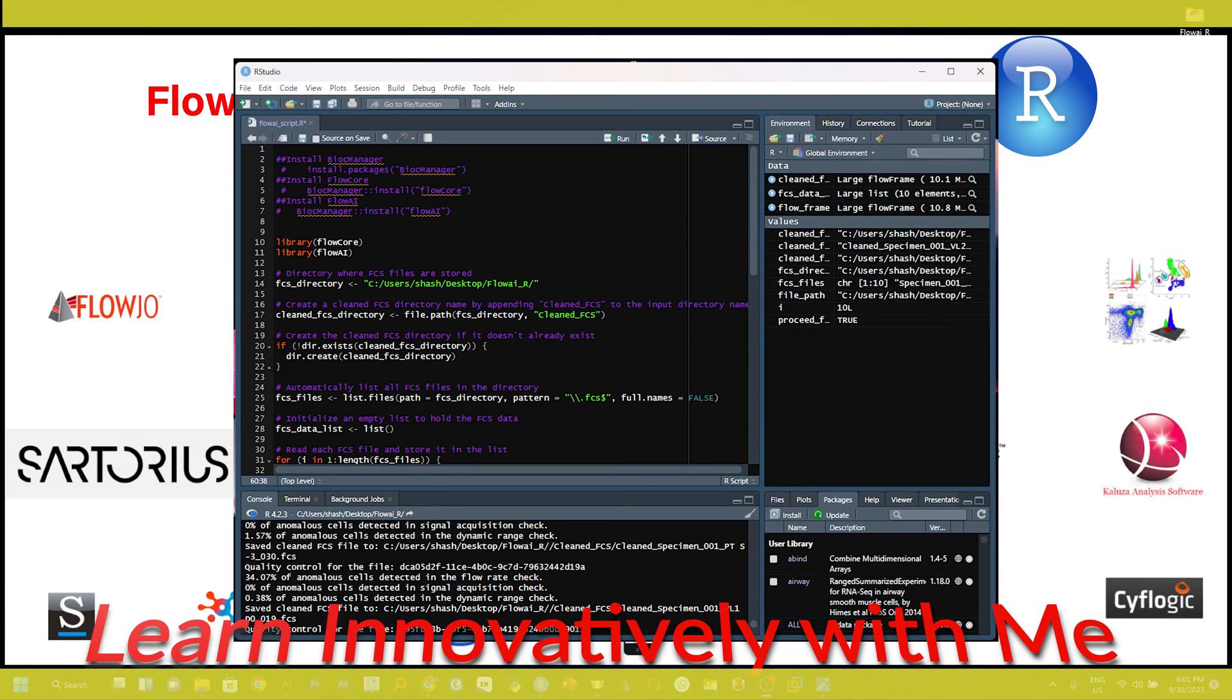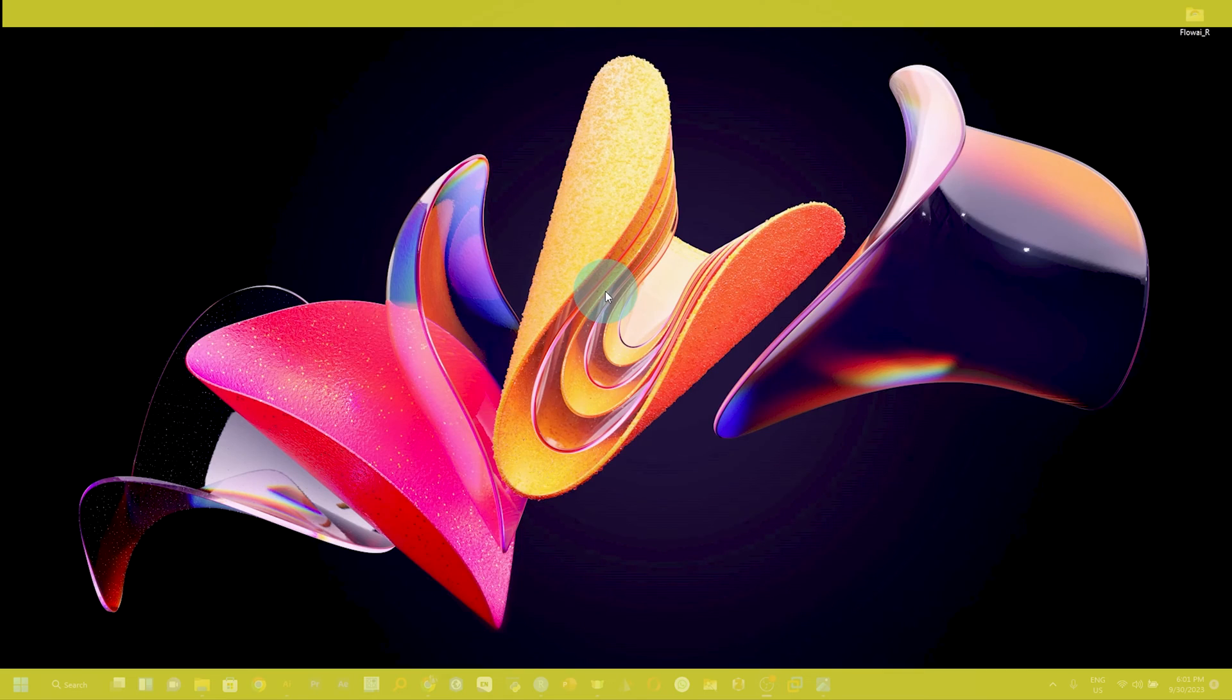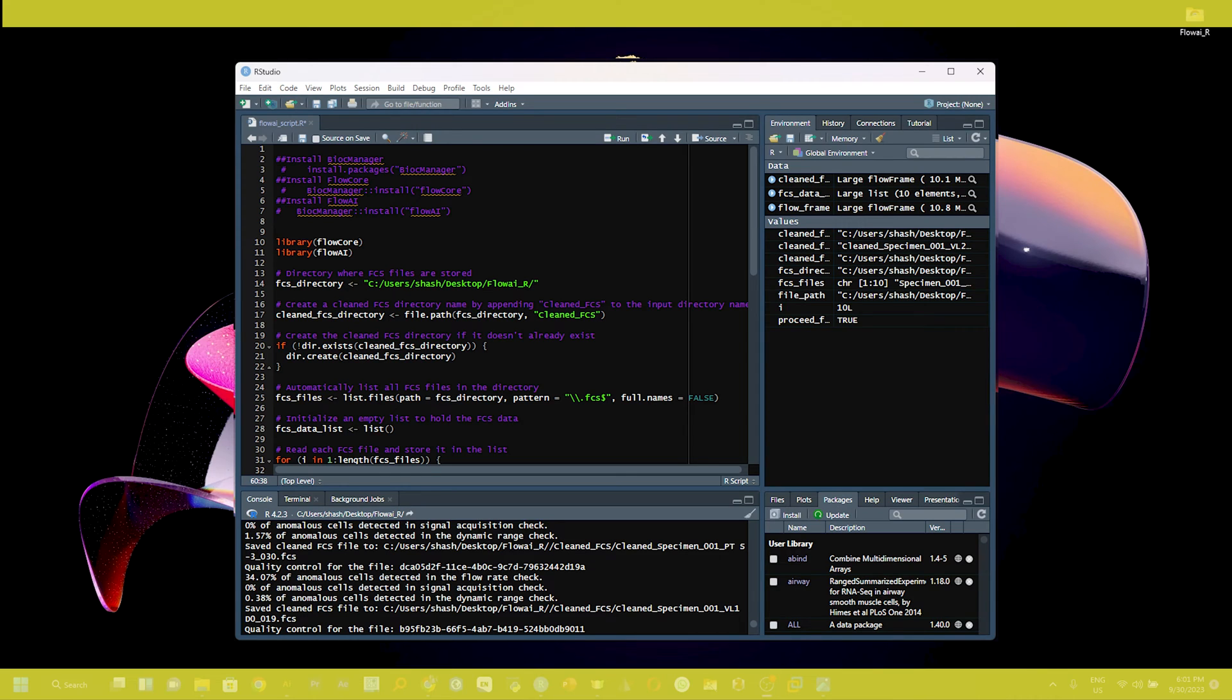Hello friend, welcome you all. Today I am going to show you how you can clean your flow cytometry .fcs data file using an R package.